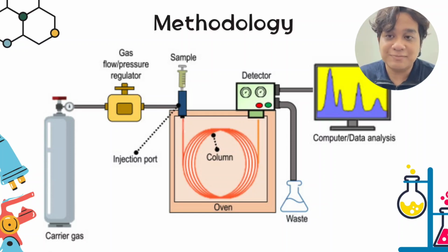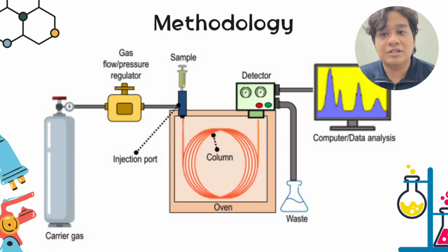This generates the peaks you see on the screen, allowing us to identify each component. Any leftover material is safely collected in the waste glass. That's a brief overview of the GC methodology.